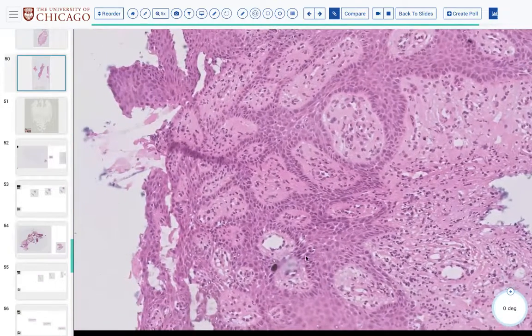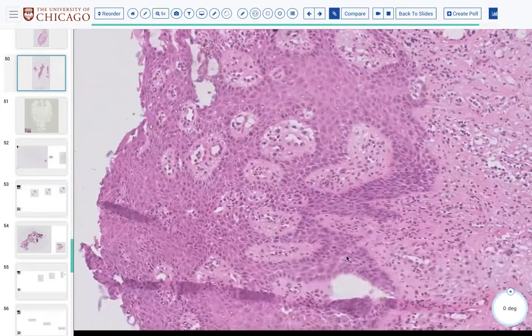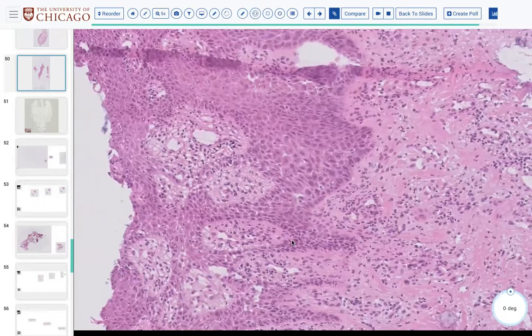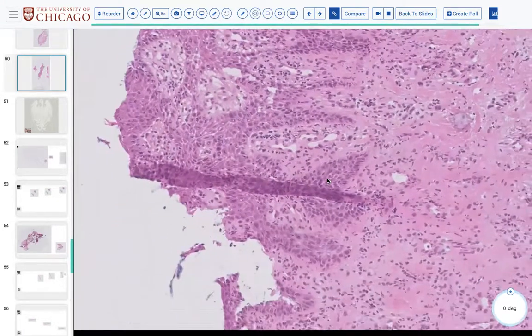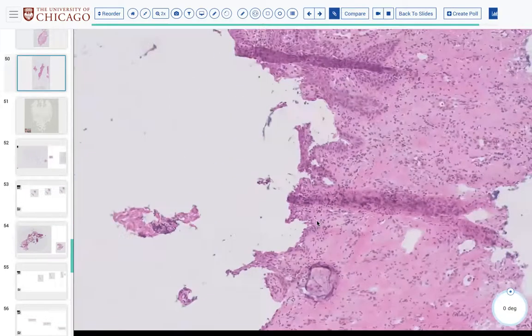Sometimes there's not a lot we can actually do if it's cut surgically at odd angles, or twisted or turned, and sometimes folded in the process of sending it to us. So yes, if you can, flatten it out as much as you can, orient it, and embed it as cleanly as you can. But honestly, sometimes these can be really challenging because they're so raggedy that it can be really hard to orient.